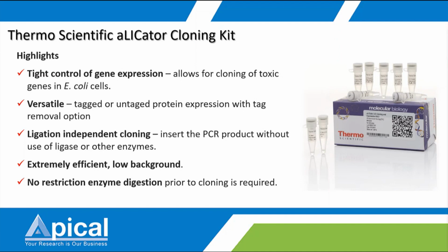As the name of the kit, aLICator, suggests, it uses a LIC, ligation independent cloning system. So the PCR product will be inserted into a target vector without using any enzyme or ligase. It works by just annealing the long complementary overhangs at the insert and the vector.